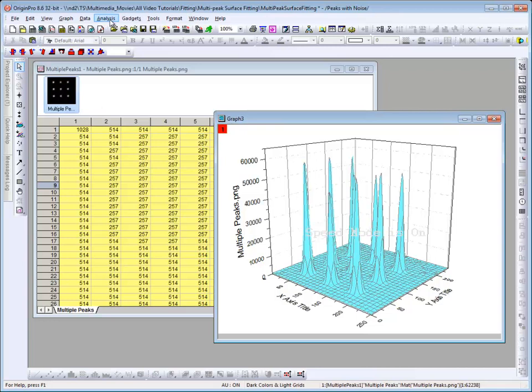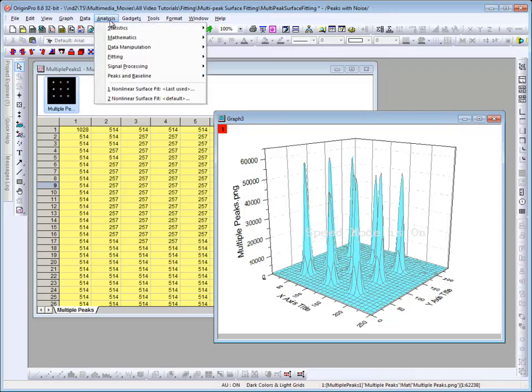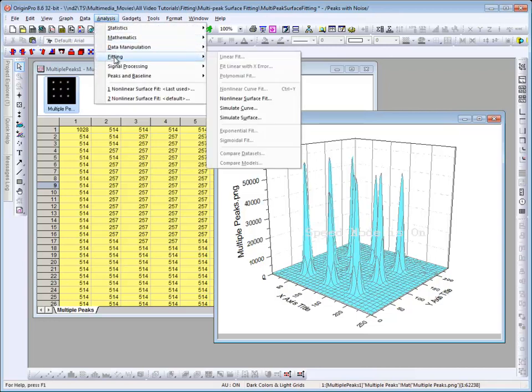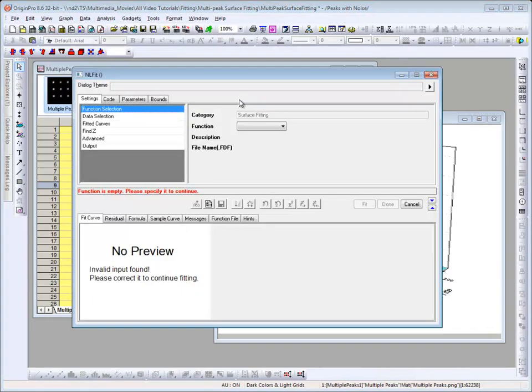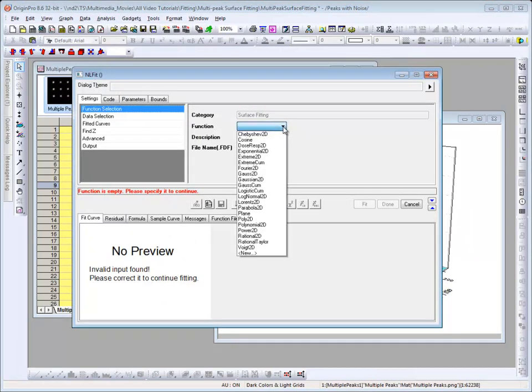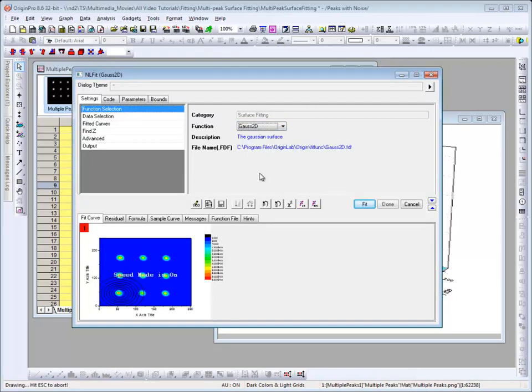To do so, we go to Analysis, Fitting, Nonlinear Surface Fit. NL Fit opens and now we need to choose a fitting function. Since we have 2D data, we only get a selection of 2D functions. I will choose Gauss2D.